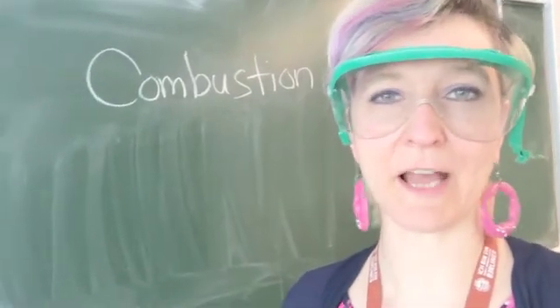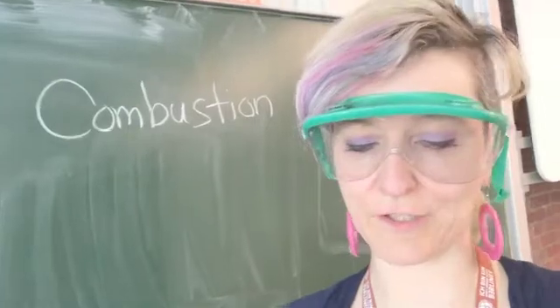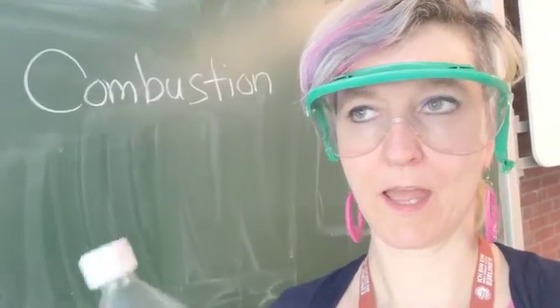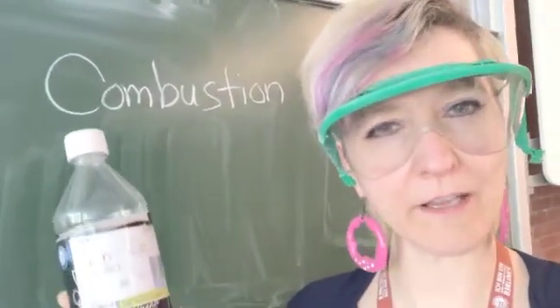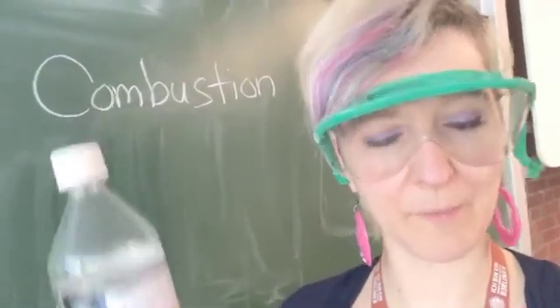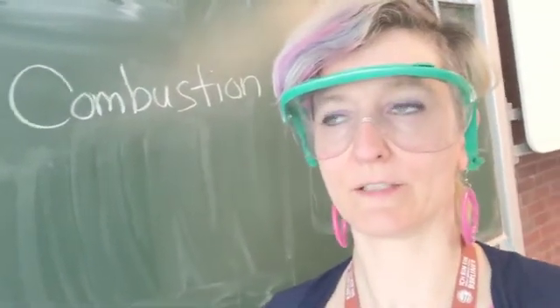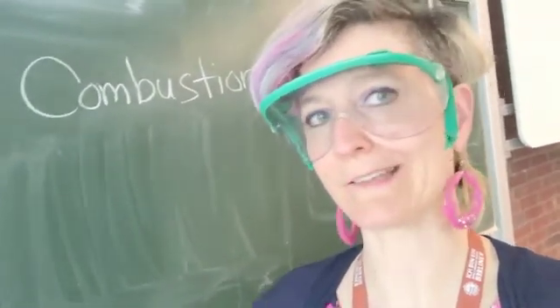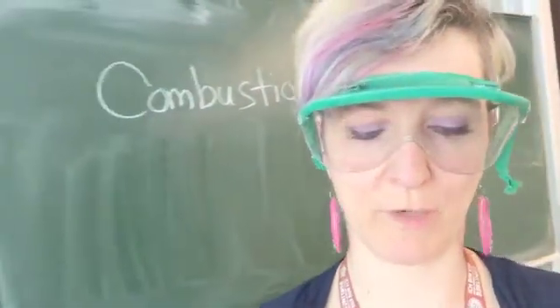In this demonstration, I'm going to show you a simple combustion reaction. There are many, many different things that I could take, but I chose to bring some ethanol. Ethanol is not a hydrocarbon, but it is very similar to a hydrocarbon that we see on a regular basis. So the most stable hydrocarbon that I could probably get is a lighter, but I thought it'd be a little bit more exciting to see this combustion reaction.